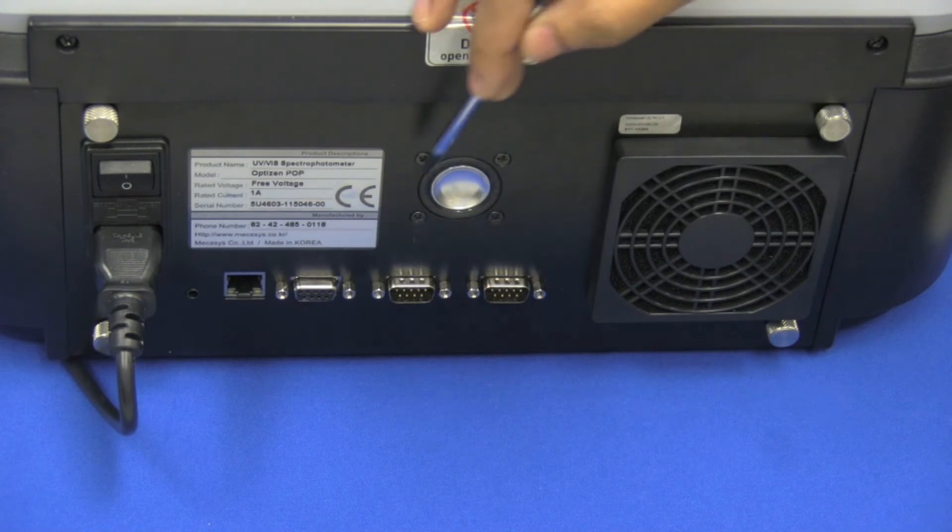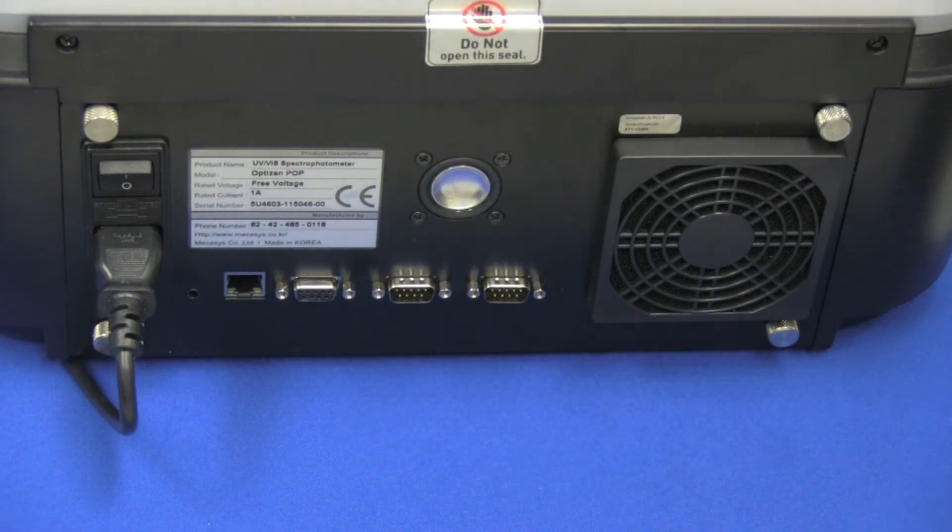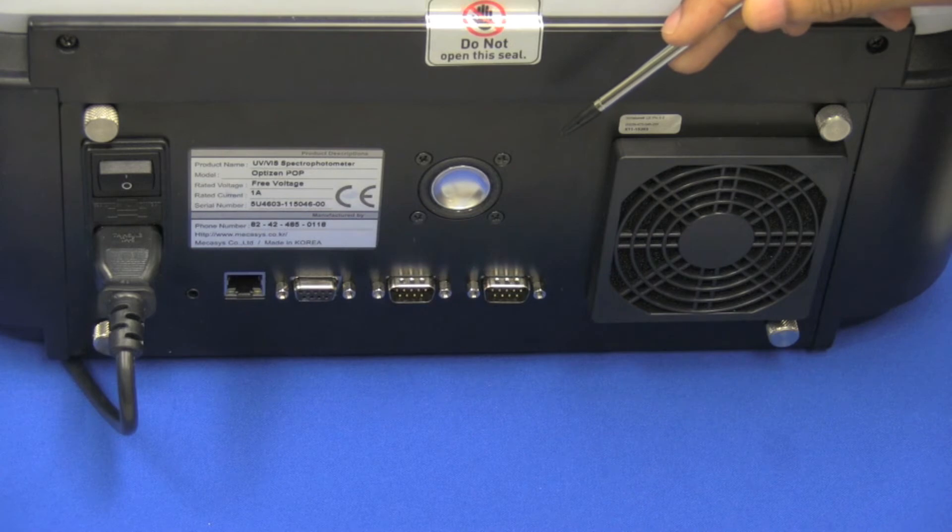Finally, this piece here is the internal speaker, which is used for the voice prompt navigation that the system uses — and it's a nice addition. You don't have to plug in external speakers for this feature.